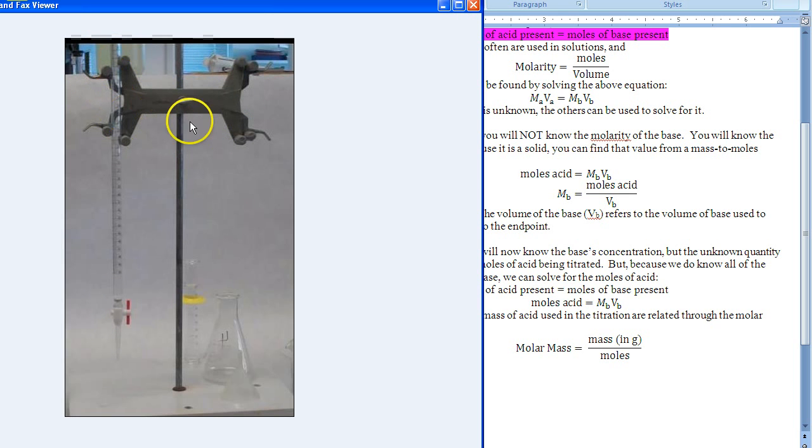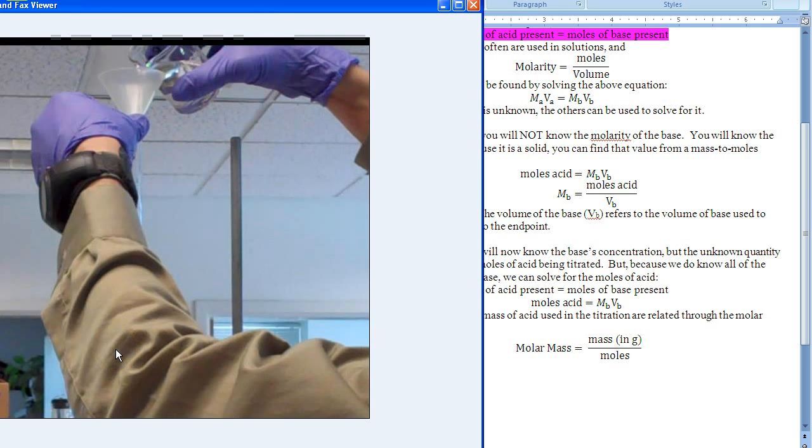That's the clamp with the springy sides that hold the burette, and the white base, as opposed to a regular ring stand which has the black base. You really should be using one of these larger, more sturdy, wide bases. You might need some flasks and funnel and other paraphernalia. As we scroll through, when you fill the burette, try to fill it with a funnel to avoid spilling.